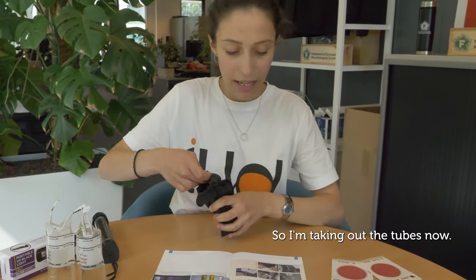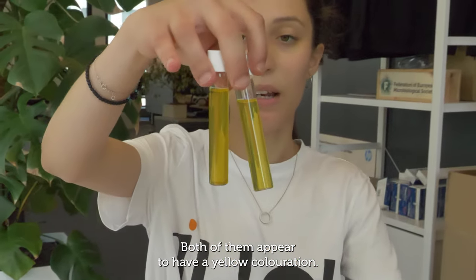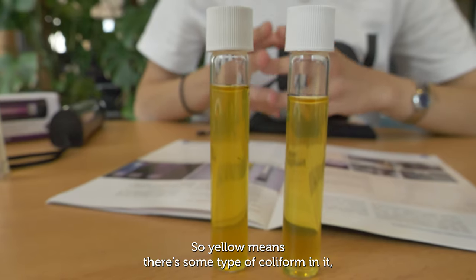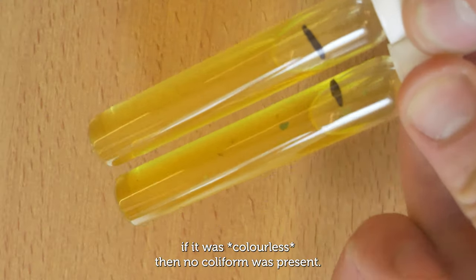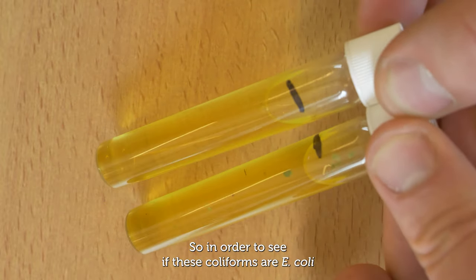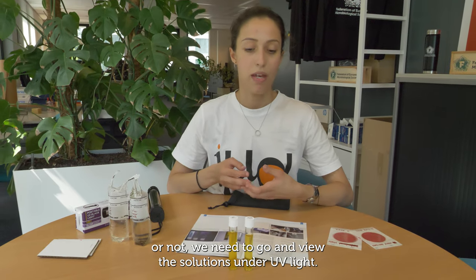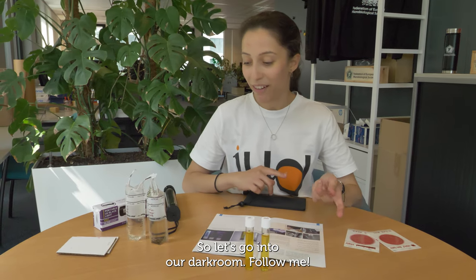I'm taking out the tubes now — both of them appear to have a yellow coloration. Yellow means there's some type of coliform present; if it was clear, no coliforms would be present. To determine whether these coliforms are E. coli or not, we need to view the solutions under UV light, so let's go into our dark room.